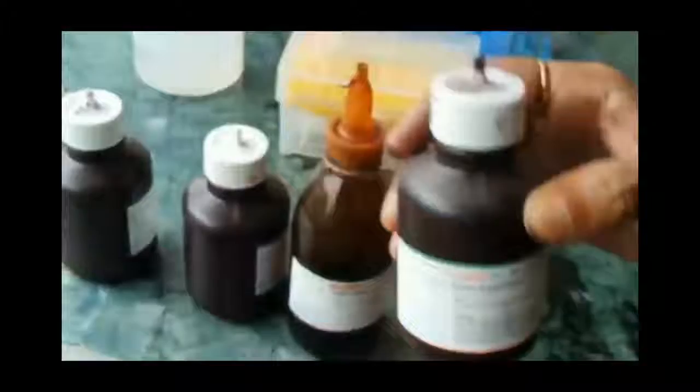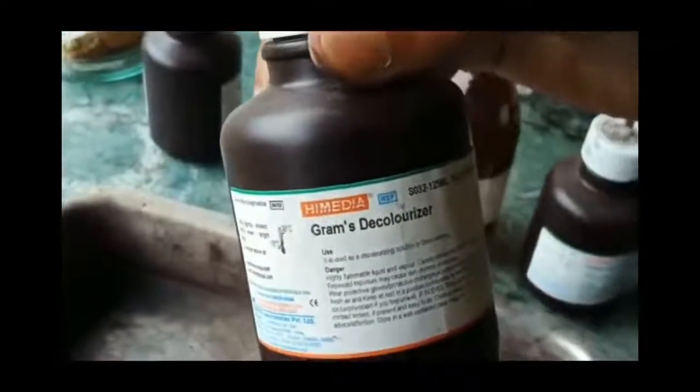So here we have the smear prepared. We take the reagents. This is the gram's crystal violet. This is gram's iodine. This is gram's decolorizer. And finally we have the safranin.